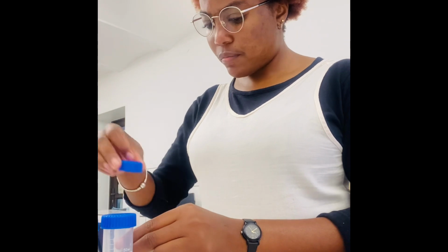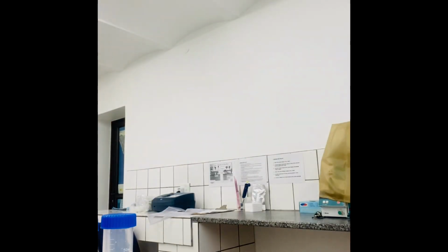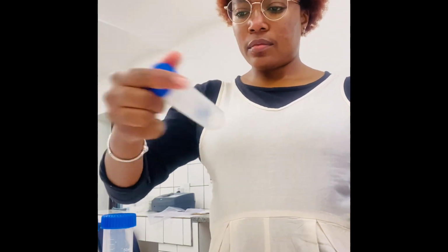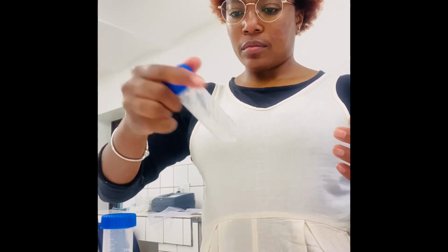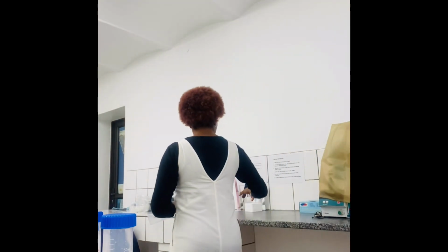And with the machine, it has its own timer. It already has the specific nutrients inside, so you just press what type of nutrient you are going to test for, and then it reads the readings.